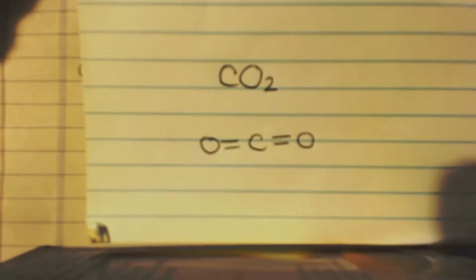Well, this is John Black, super chemist, here to show you how to make some carbon dioxide. I know a lot of people see vinegar and baking soda, and that makes CO2. I don't like that. I don't like anything where the acid, this is a nice, clean way to make it. I'll show you how in a second here.